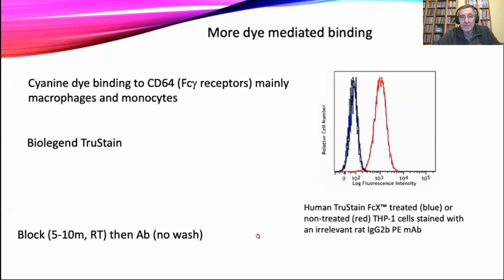And the process is very similar. Remember, that's what we always want to reduce, this non-specific binding. That's a contributor to the noise in the system. So the more we can do to reduce that, the better.